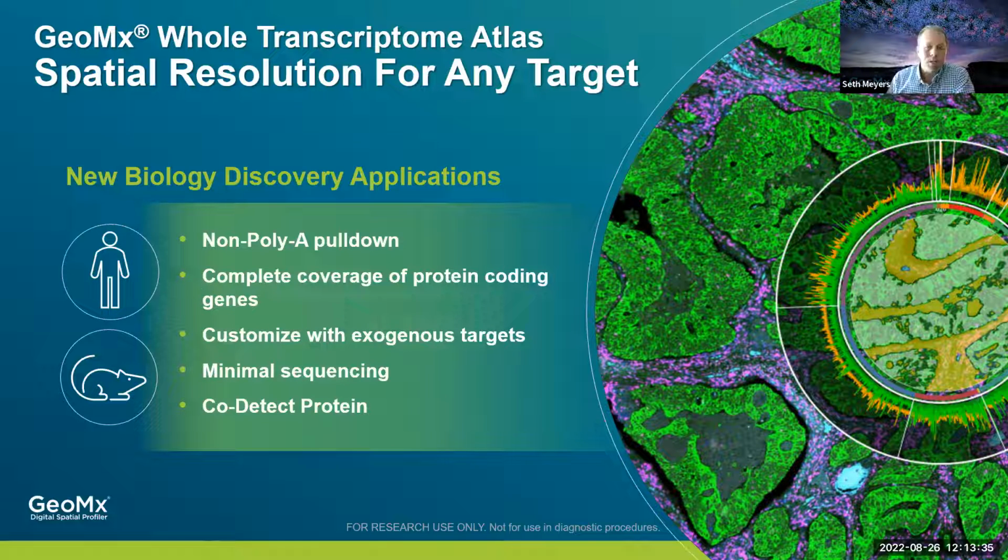There's also a customization option where you can spike in additional content if you want to look at non-coding sequences or even exogenous RNA content as well. There's minimal sequencing that's involved.